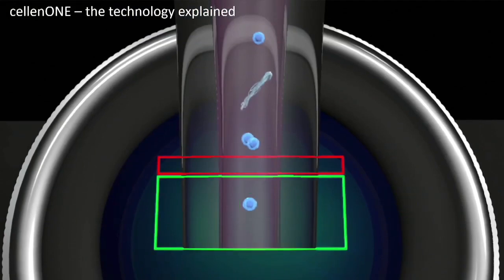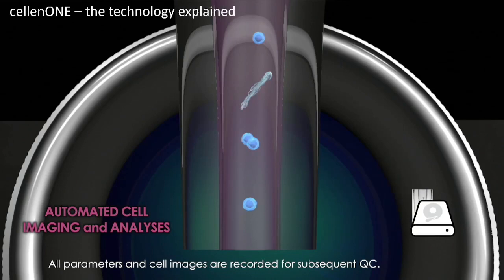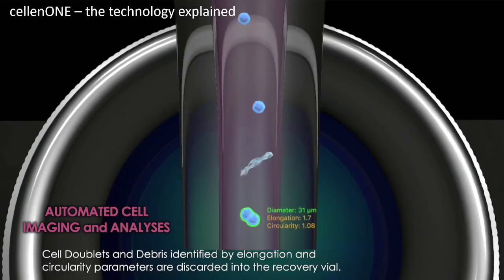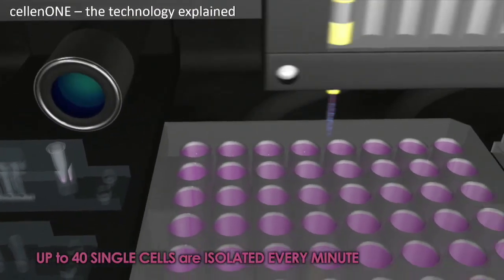That's dedicated for very precious cells. How it's working is it's basic image analysis. You detect the morphology of the cells, and if it's fitting the criteria we did define as cells I want to isolate, you will just isolate that. When you have a doublet like this, it will not fit the elongation criteria, for instance, so you will discard that, or cell debris, like this one, will be discarded as well. So you make sure to isolate only single cells and the cells you want.